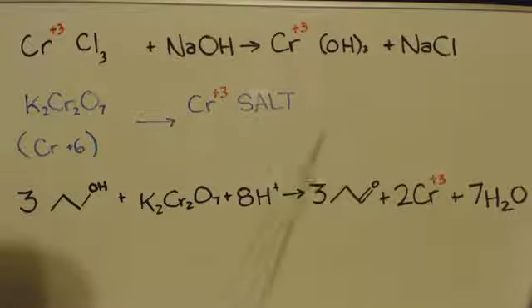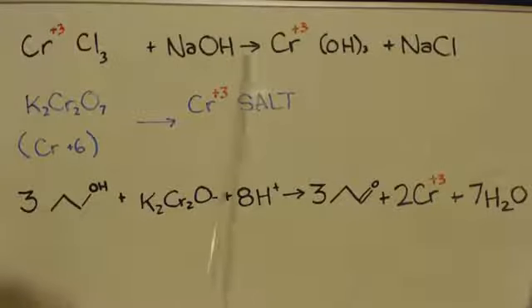You would take some sodium hydroxide, put it into your chromium waste bucket, and you would have a precipitate, because chromium and hydroxide will get together and they're insoluble, and they would precip out. And then you can just go watch this video and it'll show you exactly how to make that. And then the next step would be to go to my video called How to Make Potassium Dichromate, because it tells you how to do that from your starting product, chromium hydroxide.